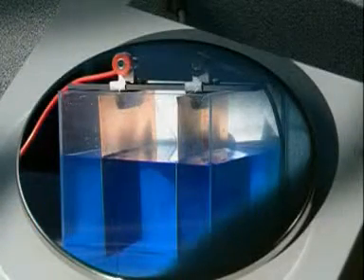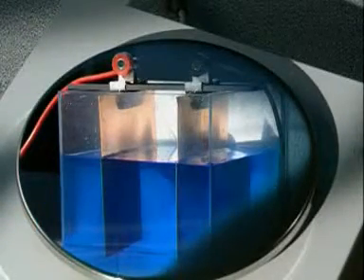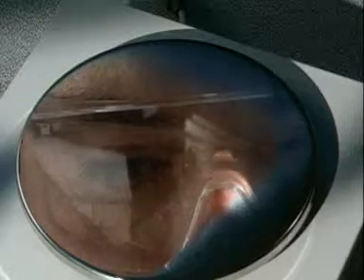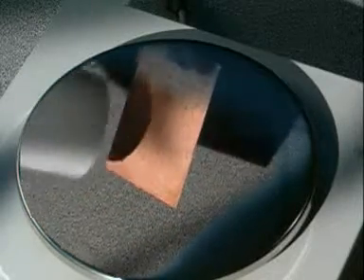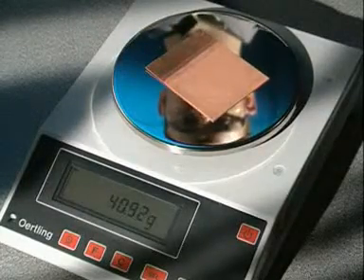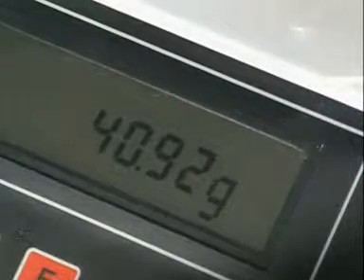Two hours later, and re-weighing provides some clues about what's happened. But first, the electrodes need to be rinsed and dried. The negative is now 40.92 grams. It's heavier than it was before.